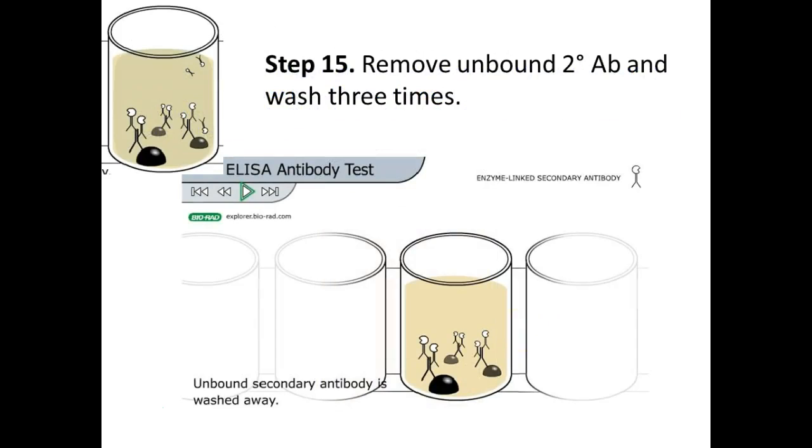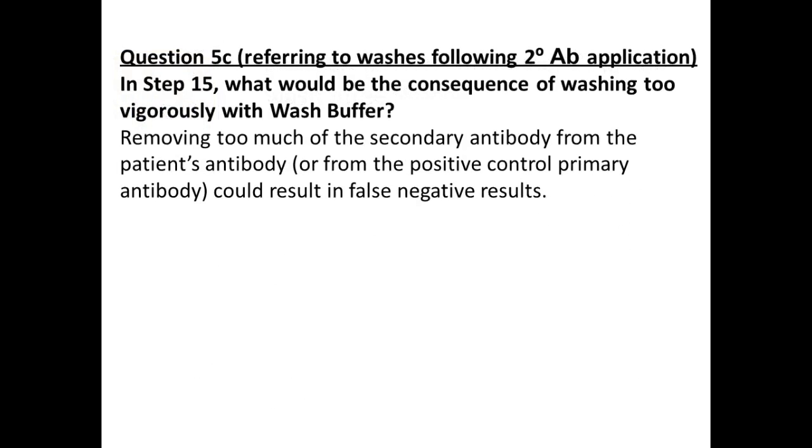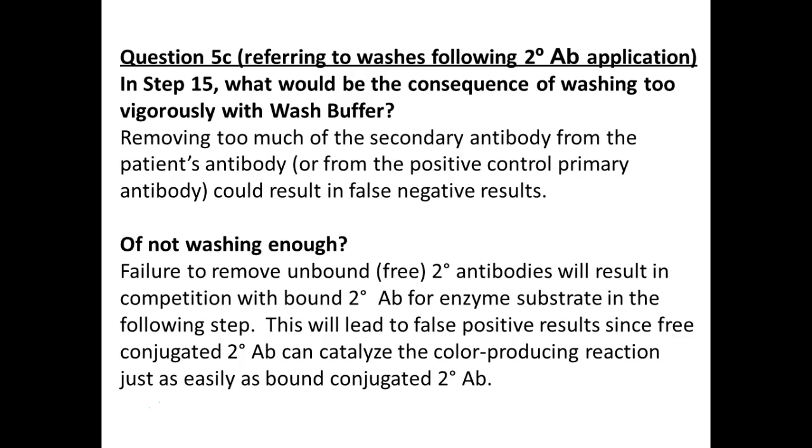The last step, which you'll have to ask me for, I keep in the fridge to keep it out of exposure to light. This time, because you could potentially have a lot of stuff in here, you're going to wash 3 times. All right, again, we don't want to wash too much. We'll remove stuff and end up with false negative results. If we don't wash enough, we can leave stuff behind and create false positives.